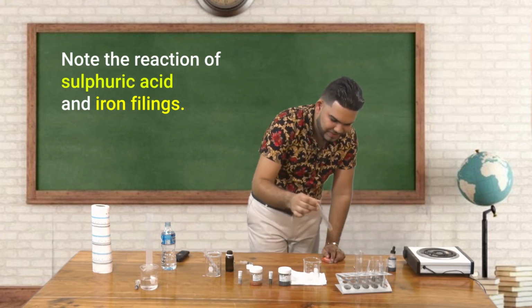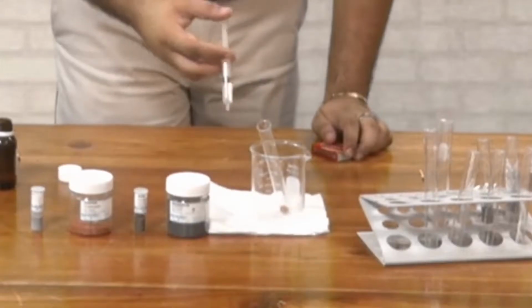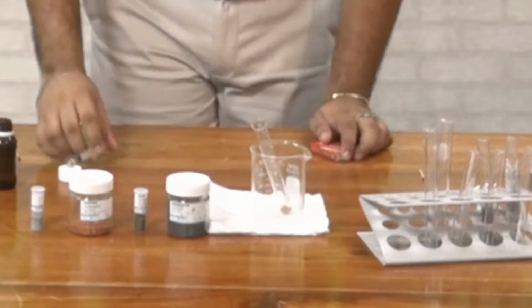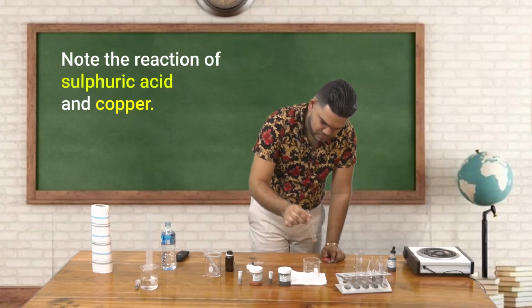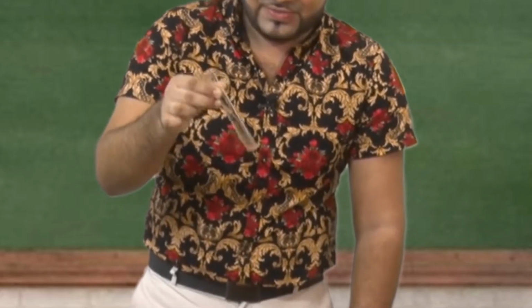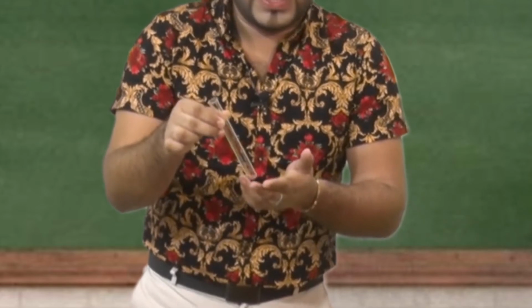So let's now go to my copper. As you can see, we don't really have any reaction occurring. So this is like a no reaction. Okay?